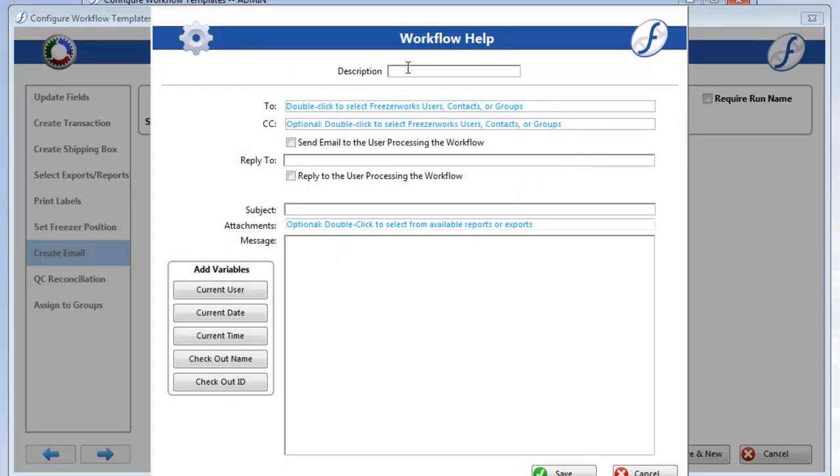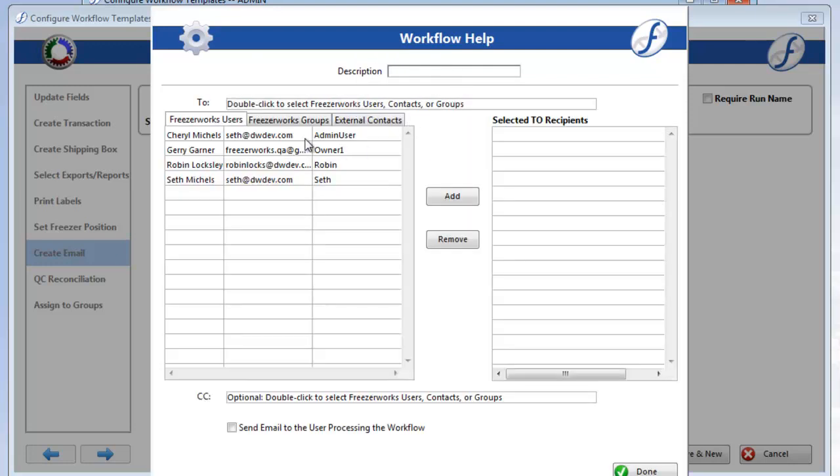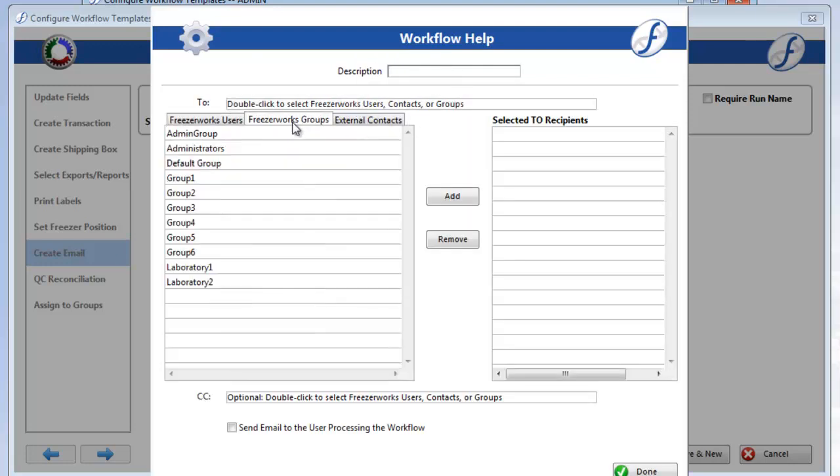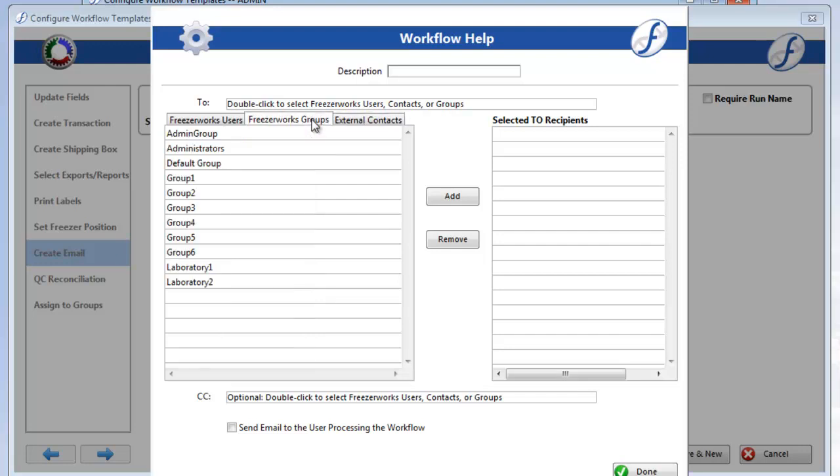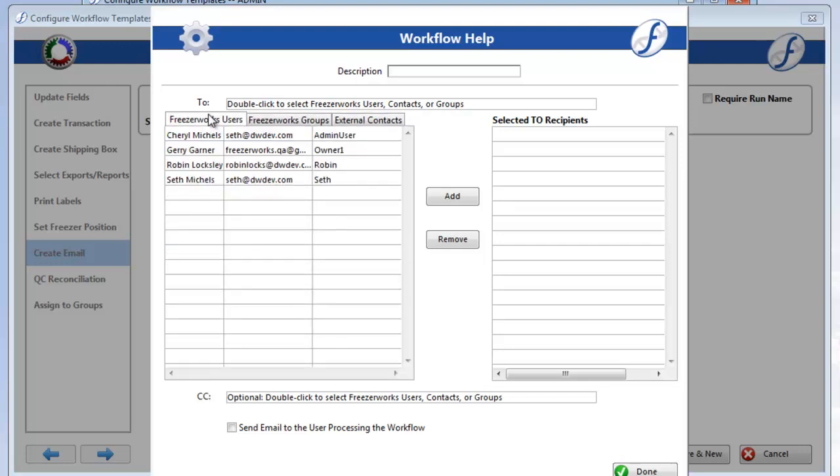The Add Email Form should look familiar to you if you've used email tools before. Take note of a couple things, however. When adding recipients, you can add Freezer Works users, external contacts that have emails in their people record, and entire Freezer Works groups.